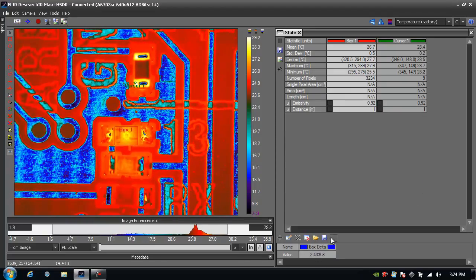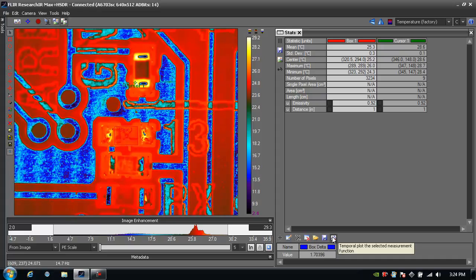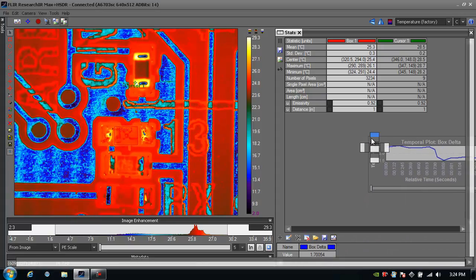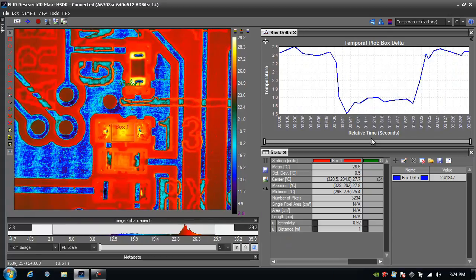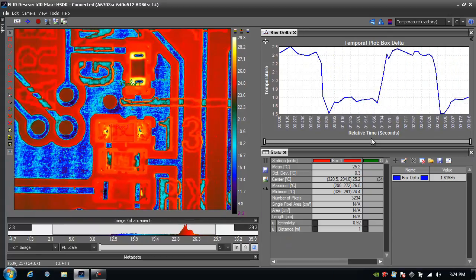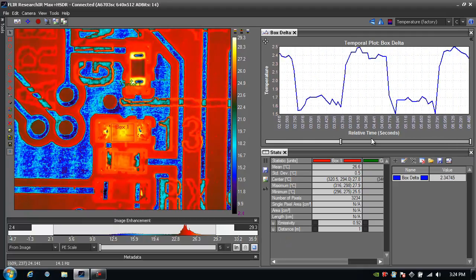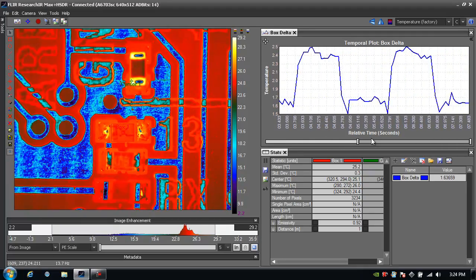If I select it I can also add that to a temporal plot or create a new temporal plot directly from the measurement function window. And here's that delta plotting out.